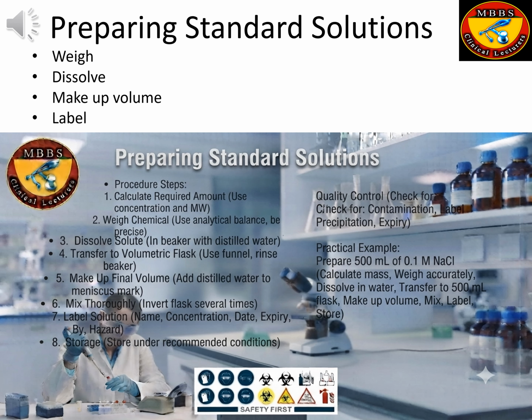Step 7. Label the solution. Include solution name, concentration, preparation date, expiry date, prepared by, hazard information if applicable. Step 8. Storage. Store under the recommended conditions, such as room temperature, refrigeration, or protection from light.